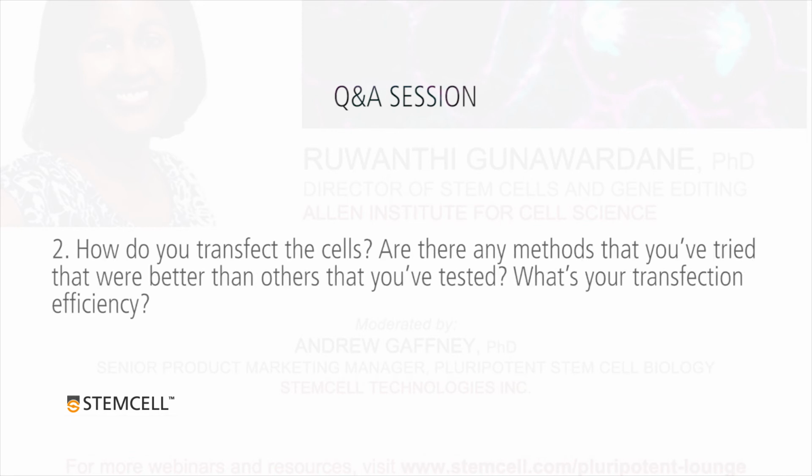Second question, how do you transfect the cells? Are there any methods that you've tried that were better than others that you've tested? And also, what's your transfection efficiency? So we use electroporation. We did try multiple different methods. I can't remember off the top of my head.